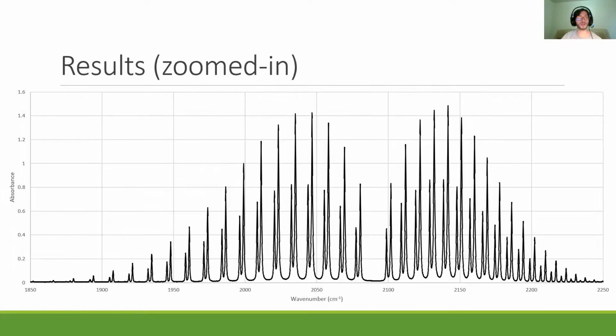If we zoom in on our DCl fundamental, you can see that we have a whole bunch of different transitions going on inside of our vibrational transition from 0 to 1. And these are our energy level transitions, right? So this one is going from J equals something to J equals something. It's absorbing energy to go to a different rotational energy state.